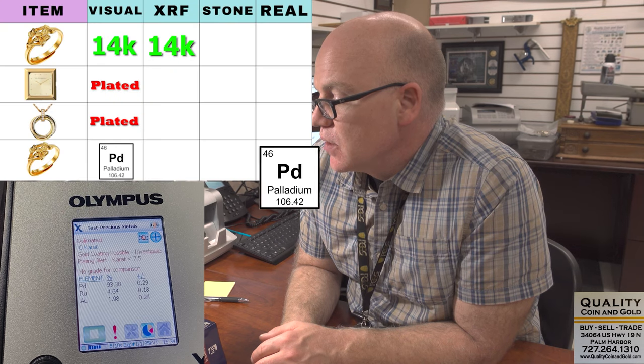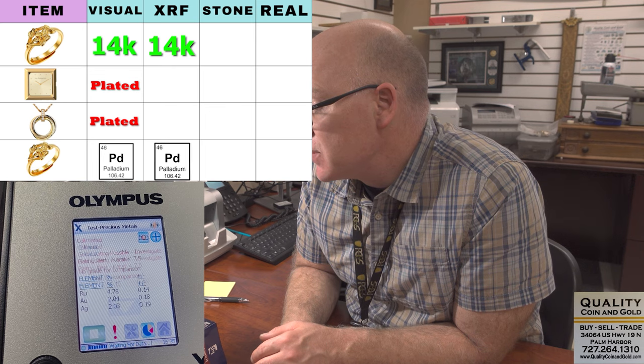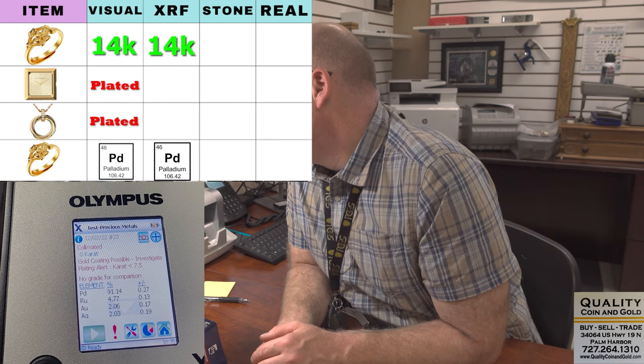So this is supposed to be palladium — and it's testing out really good. We're getting the gold coating warning, and that's absolutely fine. We don't care about that because it's high content palladium. It's testing at 91.14% palladium. So we like that.